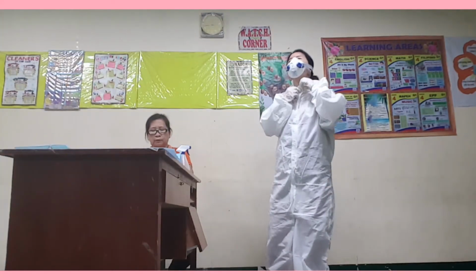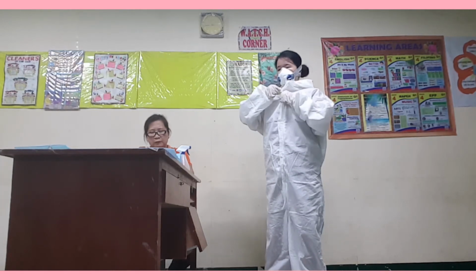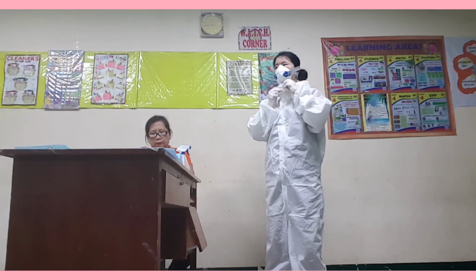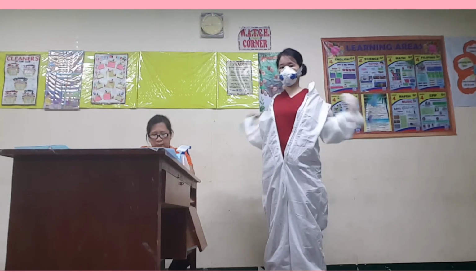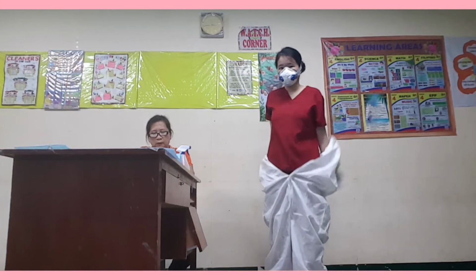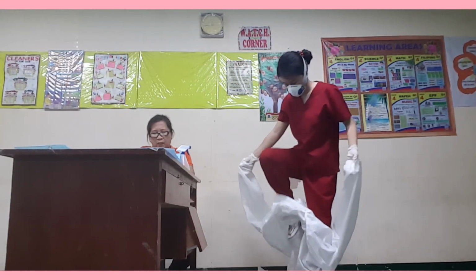Procedure number 14. Remove coverall. Avoid contact or scrubs with the outer surface of the coverall. Lift chin and find the zip at the level of your belly. Carefully trace your fingers up to find the zip tab and fasteners with one hand. Hold the top of the coverall with the other hand. Unzip or unfasten completely before rolling down and turning inside out.